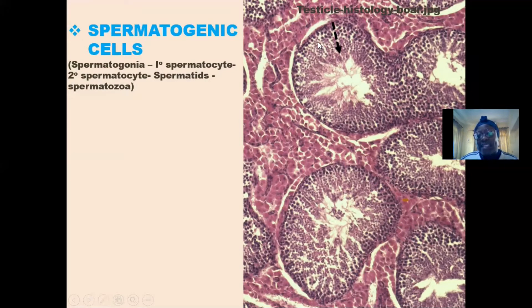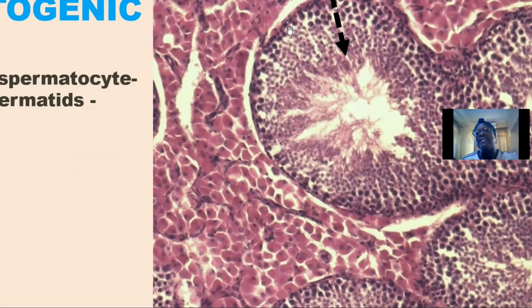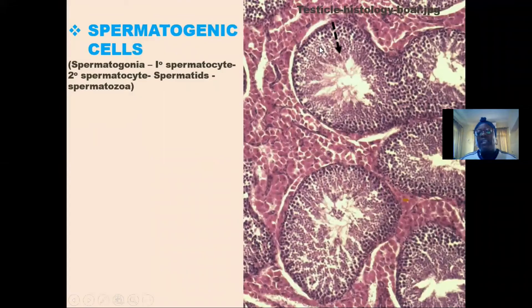At this end, if we zoom in into this image, we will see that at this region we have dark pigmented cells, which are called the spermatogonia. These are the spermatogonia cells. They are seen at the margin of the seminiferous tubules.